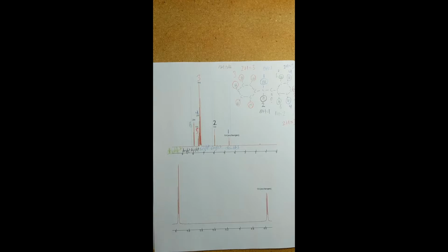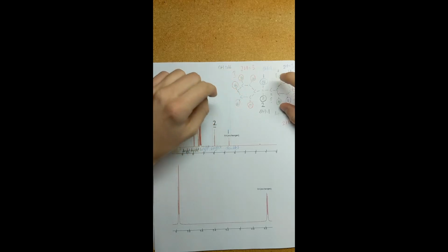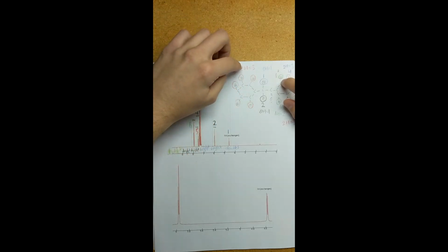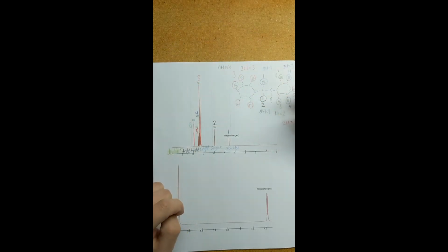Now finally, for this proton NMR, I have gone in and labeled our N+1 rule for all of our groups, which shows us the proximity of protons. As you can see for these, looking at the adjacent carbons, taking this one in reference, each adjacent carbon has 1 proton, so our N+1 would make it 2 + 1 = 3, and that would be the same for all of these.